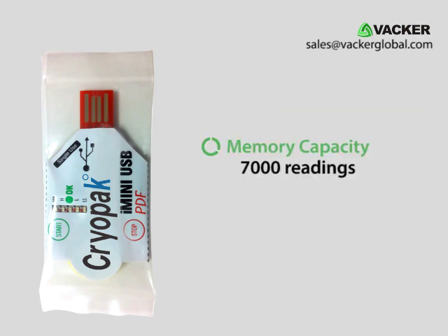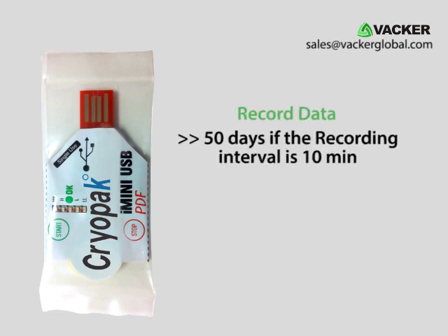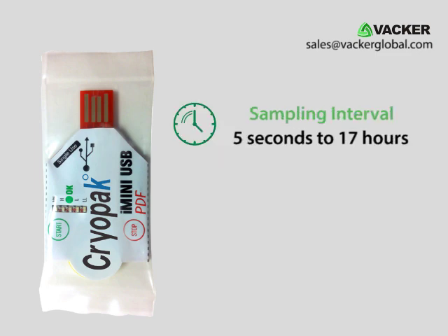It has a memory capacity of over 7,000 readings. This means it can record data for more than 50 days if the recording interval is 10 minutes. We can program the interval from 5 seconds to 17 hours.